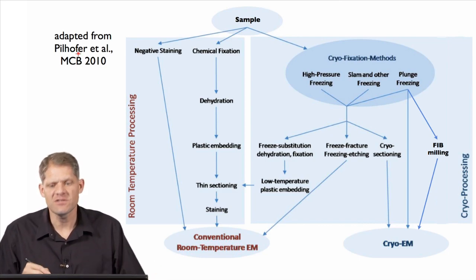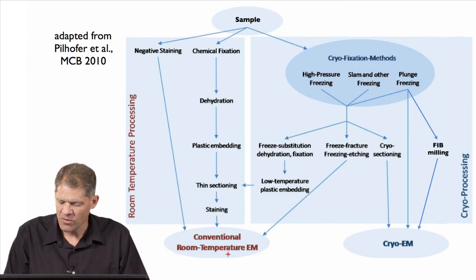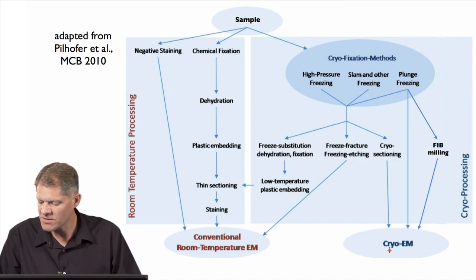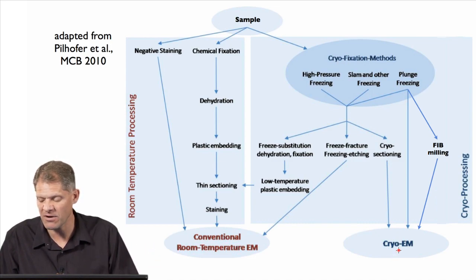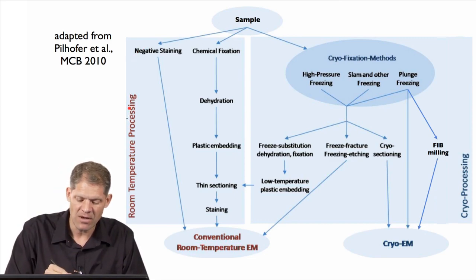This is a flowchart that summarizes many of those techniques. Let's start with a sample at the beginning. And at the end of the chart, we see there's two basic kinds of electron microscopy. There's conventional room temperature electron microscopy, where the sample is at room temperature when we stick it into the microscope. Then there's also cryo-EM, where the sample needs to stay frozen as we insert it into the electron microscope.